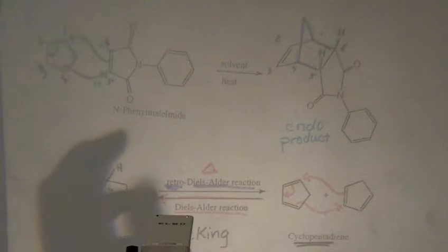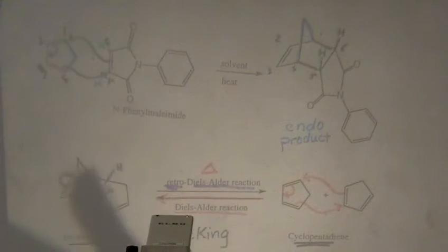The other nice thing about this reaction is it's done in 10 minutes after 10 minutes of reflux. You distill off the ethyl acetate, so just keep it hot after the reflux. You don't want to cool it down at all because you're going to convert it right to distillation. This whole time you're doing it in a water bath, so you want to keep that water bath hot. Once you do the distillation, then you're going to precipitate the solid with hexane, filter it, recrystallize with ethanol and water, and you should get this really nice white, crystalline solid.